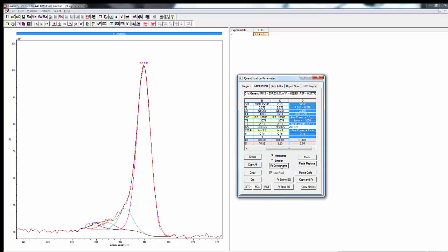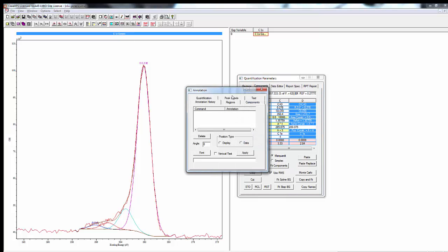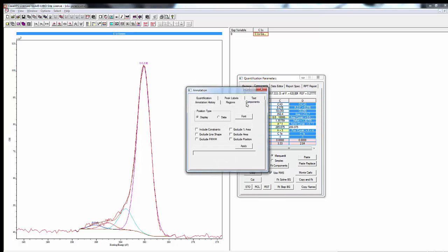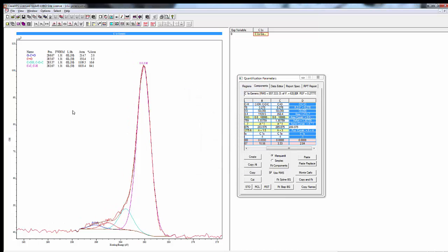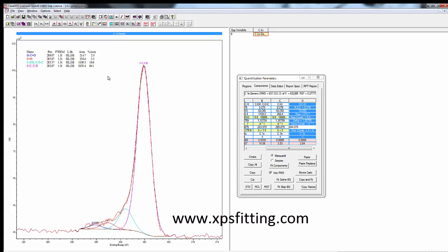And if we hit fit, that's a pretty reasonable fit for adventitious carbon. We're going to add in our components so that we can see where they are. And then we can just save this as some generic files, say carbon 1s generic, and we have this as our starting point that we can then propagate to other files as we see fit.